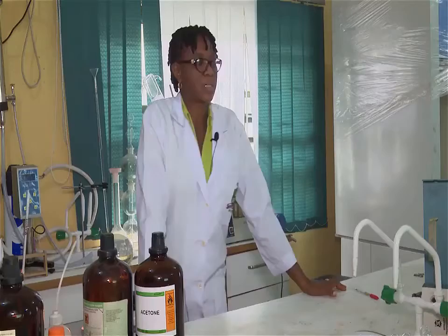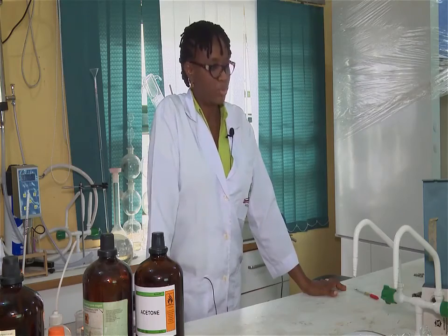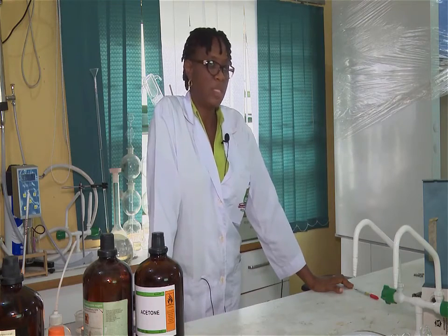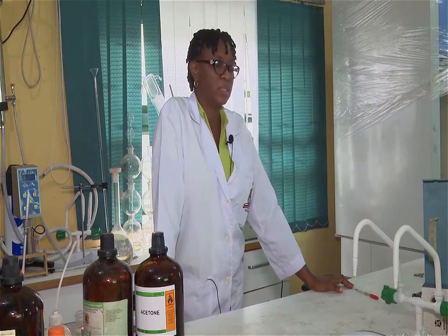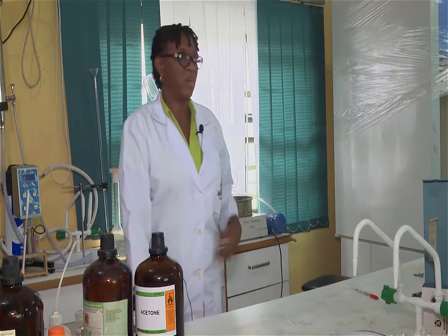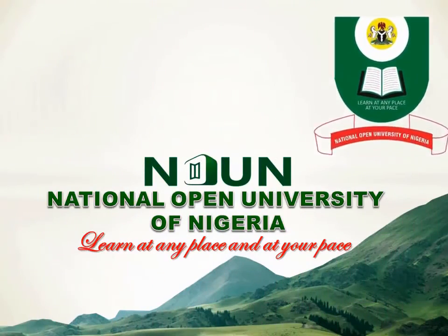So with this, we have been able to go through the experimental process of how to determine the density of a compound, the boiling point of a liquid, and the melting point of a solid. With that, we have come to the end of our experiment 3.